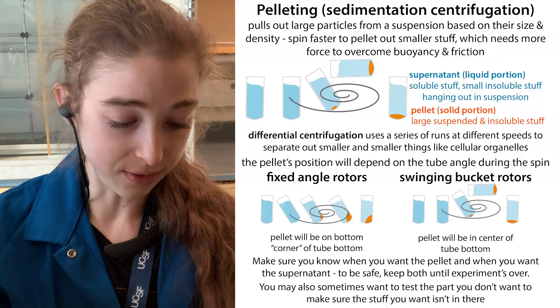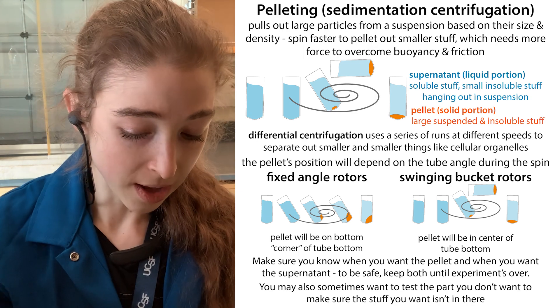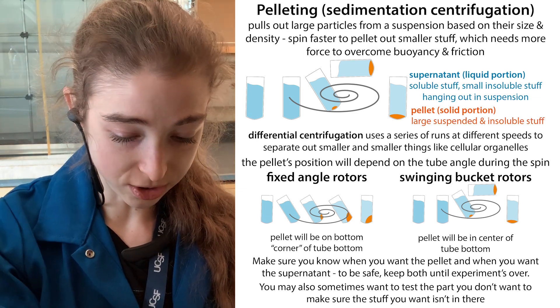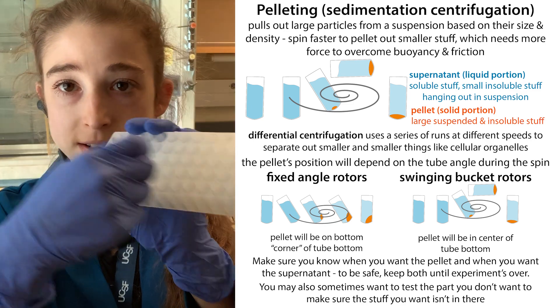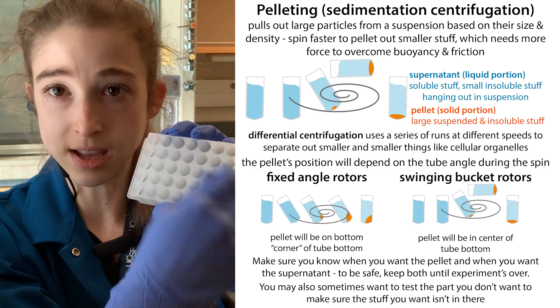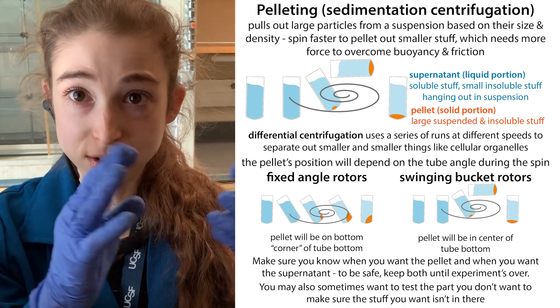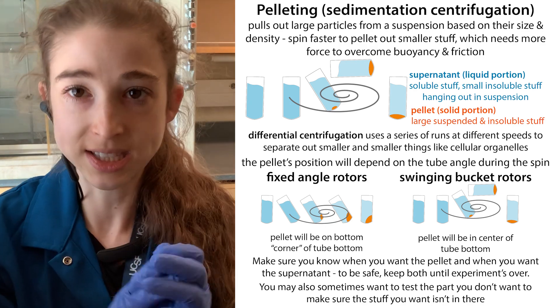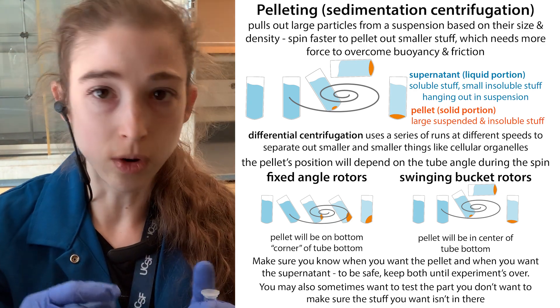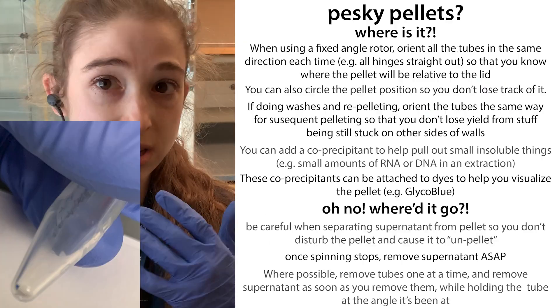If you have a really tight pellet, you can put it in a sonicating bath for a few seconds. With large ultracentrifuge tubes, you can scrape the pellet against the tube rack to break it into smaller pieces that the liquid can then resuspend.